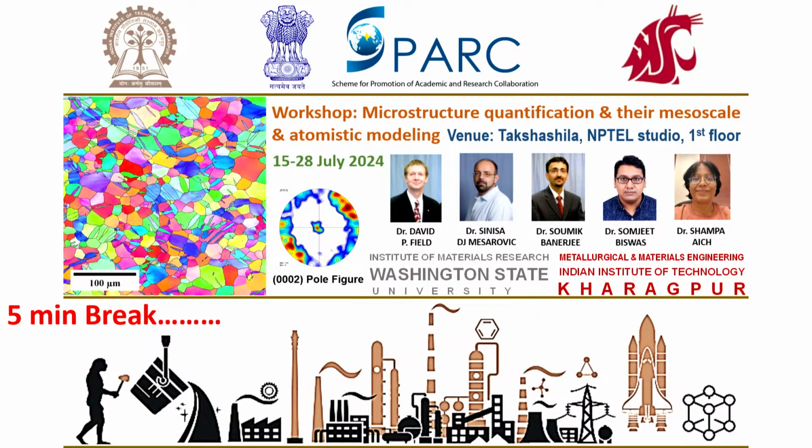So this is the specific texture component. Okay. And then we're going to say, show me, just make them all blue, that's fine. Say okay. And we're going to enforce sample symmetry or not. Let's just not. Let's just say okay and see what we get.